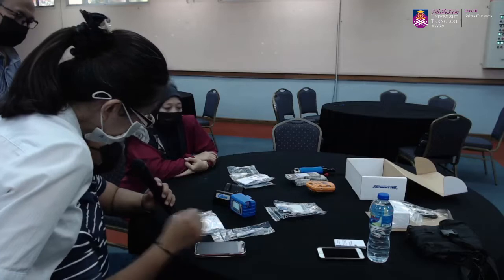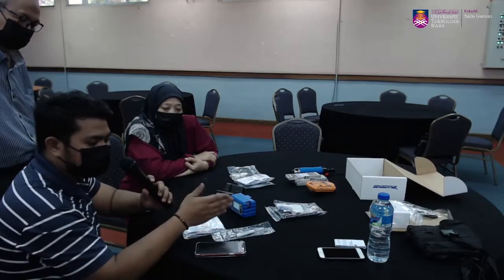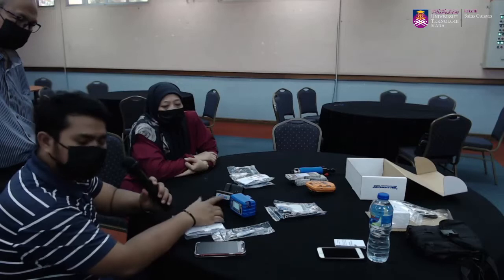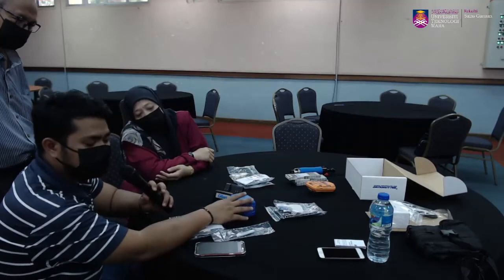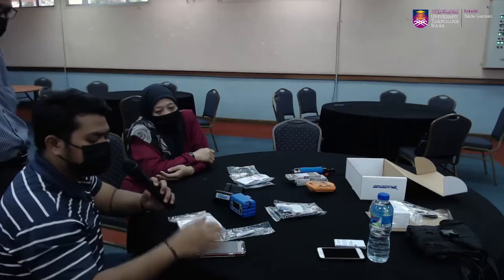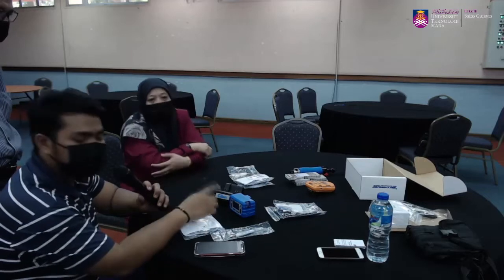So usually bila kita dah start and then bila kita dah connect properly, nanti dia akan tunjuk in terms of berapa from the start, kita pukul berapa kita start, and until the end, flow rate dia maintain tak 1000 cc per minute. Kalau contohnya in the middle ada fluctuation, dia turun kejap sebab Tygon tubing tersangkut ataupun ada back pressure, nanti dia akan mentionkan dalam graph tu, dia akan tunjuk ada fluctuation ke bawah dan dia akan try and push back dan dapatkan flow rate yang kita dah set.